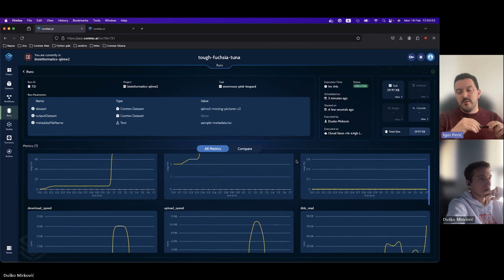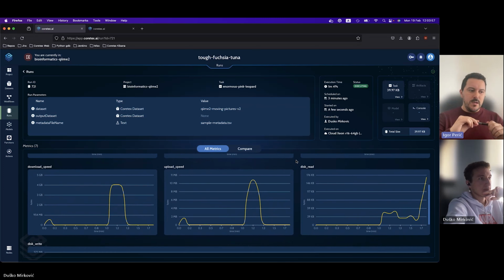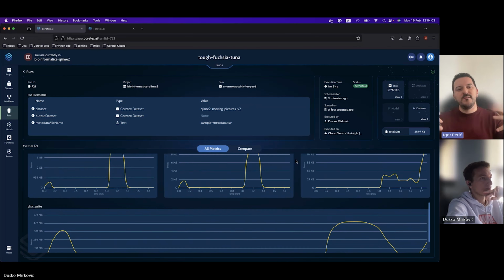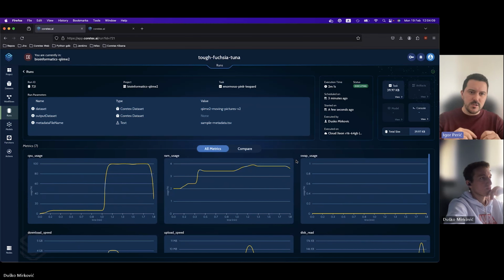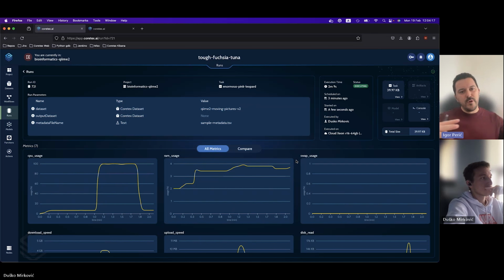And that's particularly useful when you're merging a couple of different data sets into one. You don't have to create deep copies of those. You can just merge them by reference, and then they become locked and cannot be changed. So that optimizes the speed of execution, because you don't have to refetch a data set, because you already have it cached. Even though you merge it with another data set, its caching is based on individual items of the data set.